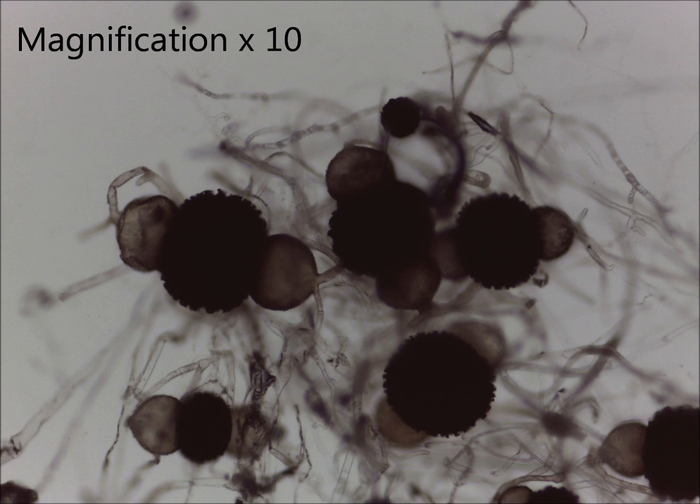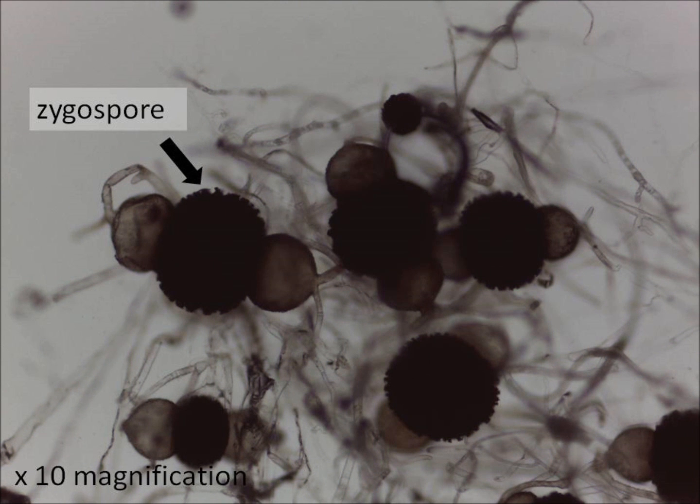Also, you can use the fine focus to change the focal plane so that you can look at different parts of the structure. You should be able to see several examples here of the zygospores.